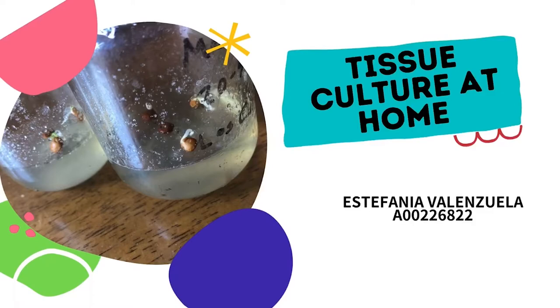Tissue culture of lentil seeds at home. In this video, the protocol for lentil germination is going to be described.